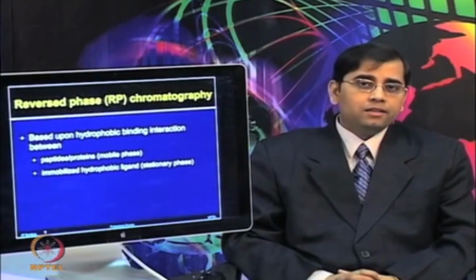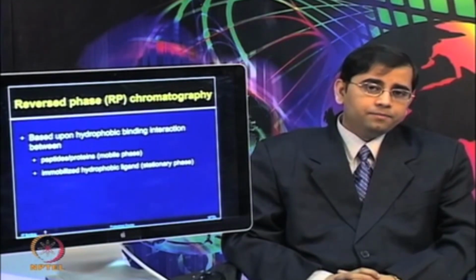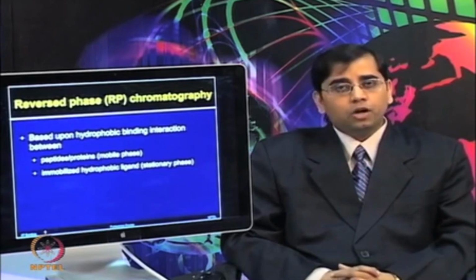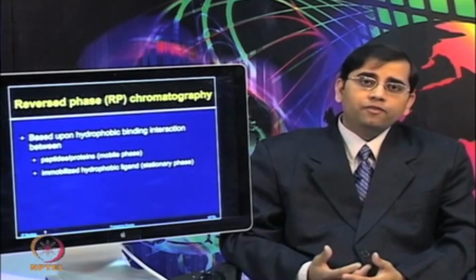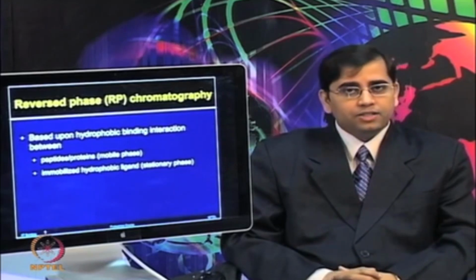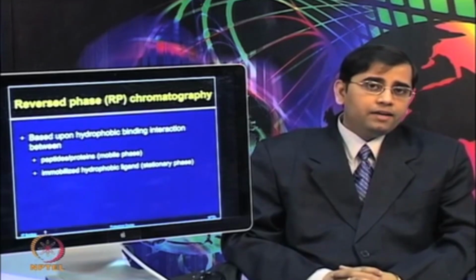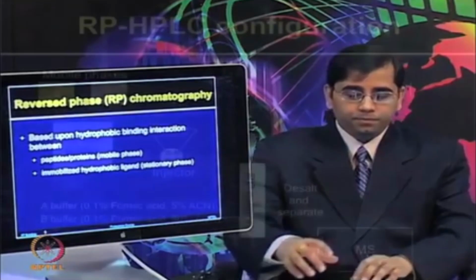By utilizing this hydrophobicity, one can separate the peptides. However, if your proteome mixture or the peptides are very complex, then one can further use another type of chromatography method, such as strong cation exchange, as well as different types of multi-dimension separation.